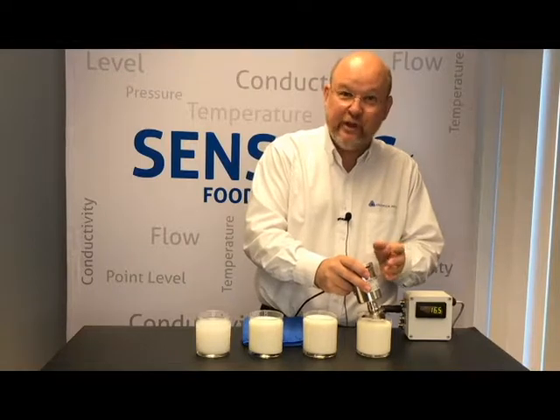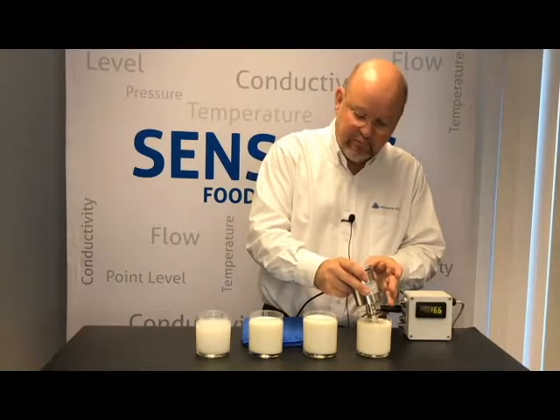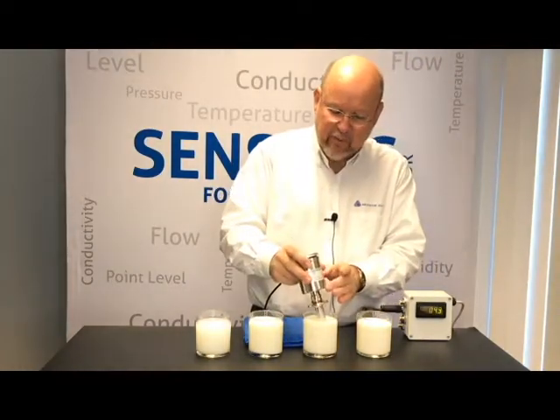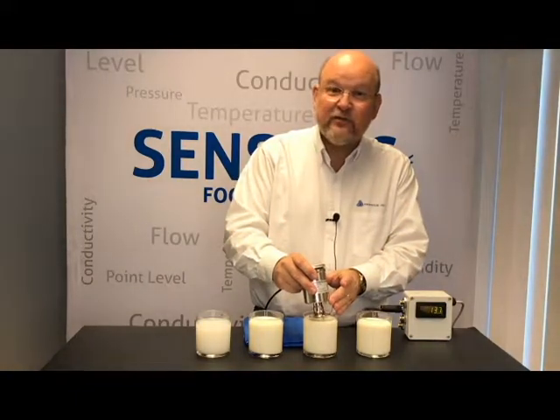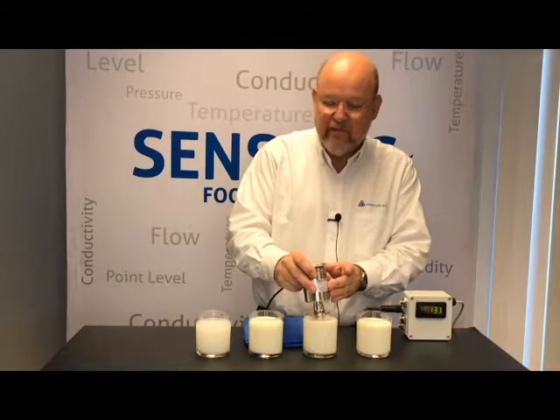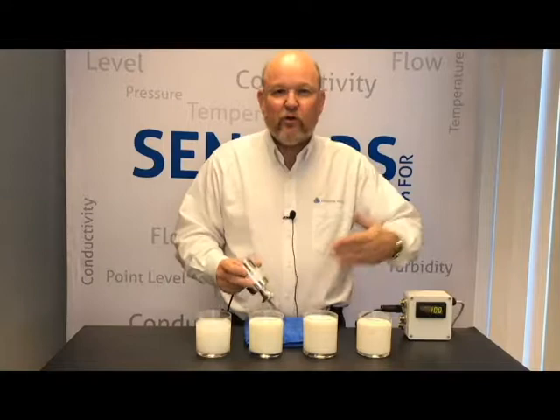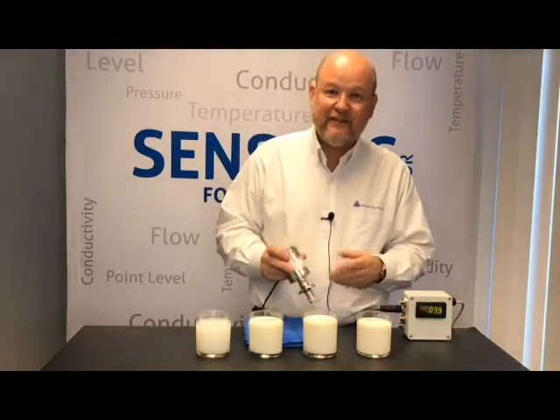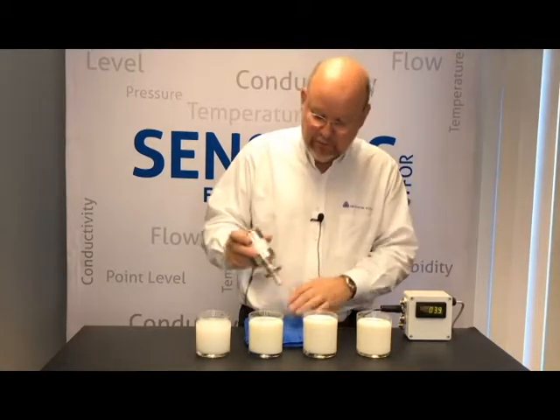On my display, which you can't see, I have a reading of about 79,000 NTUs. Taking the ITM out, moving over to our lower concentration, you can see that the milliamps have also dropped, and my display is indicating a turbidity of 61,000 NTUs. At this point, we would no longer be pushing product into a final product tank, and instead be recovering it probably for high solids waste use.